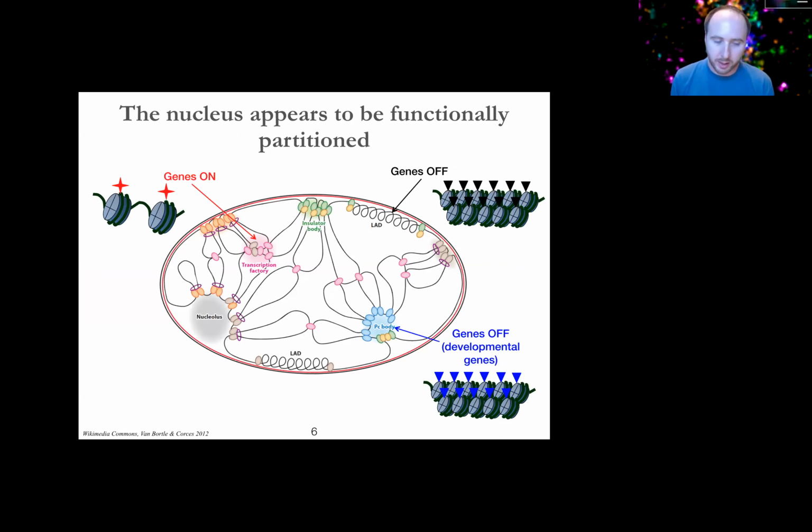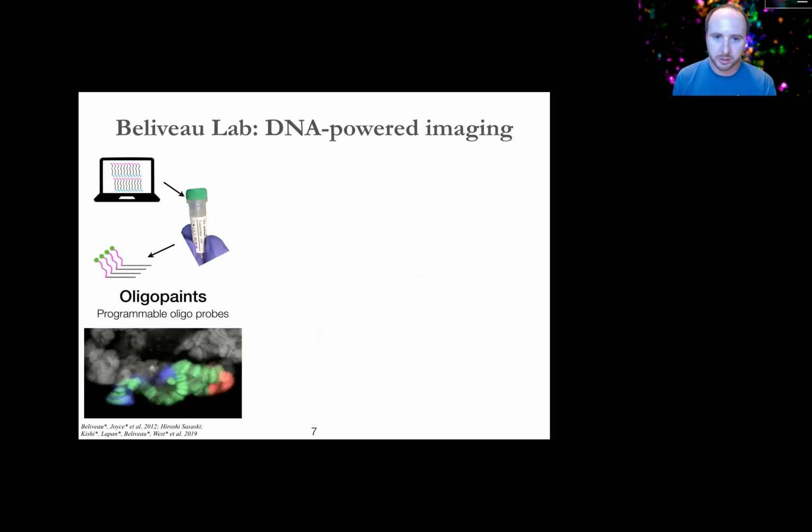So I think ultimately it's going to be a combination of spatial mapping, in terms of understanding where individual aspects of the genome are in a given cell state or cell time, combined with understanding how the microenvironment is affecting the biology of the sequences, for us to get a really integrated view of how genome organization impacts the processes that happen in the nucleus.